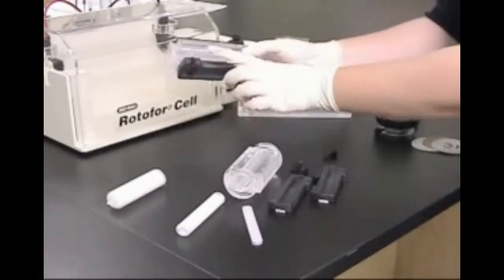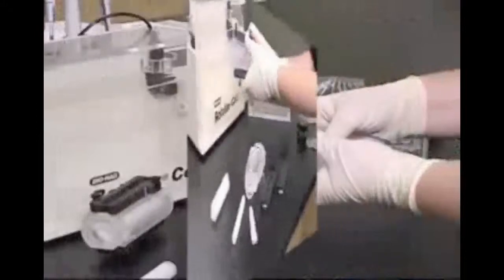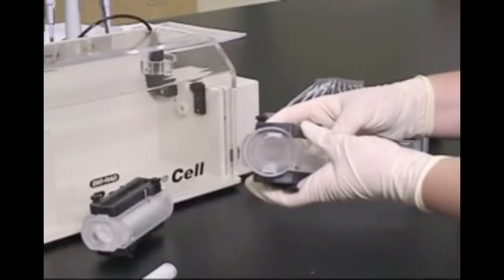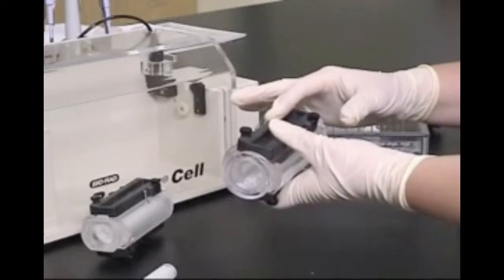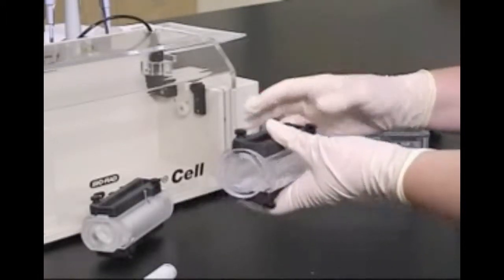Both focusing chambers have two sets of 20 holes, or ports, that are used for sample loading and for harvesting. The ports are covered by black plastic port covers, which are held in place with black Teflon screws.